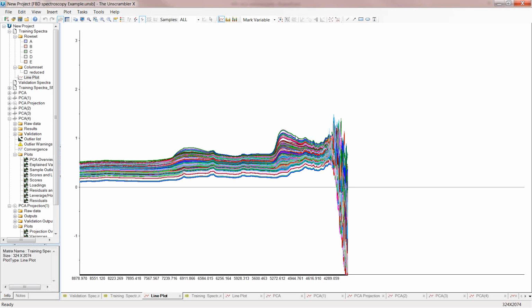In nanometers, which people tend to think of, it's around 1400 nanometers, and I think it's 1800 nanometers. Because I know that's what I'm looking at, I'm focusing just on those wavelength ranges, because I know that the rest of the wavelengths don't really give me information about water.